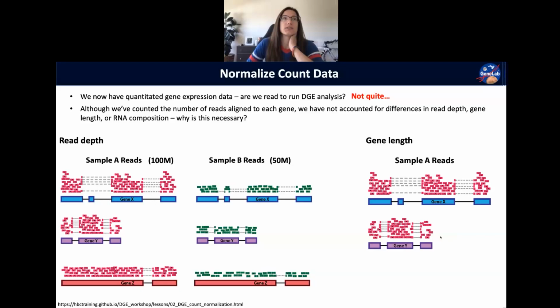So is it important to correct for gene length when we're doing comparisons between samples? No, maybe not as important. Yeah, you guys are getting it.